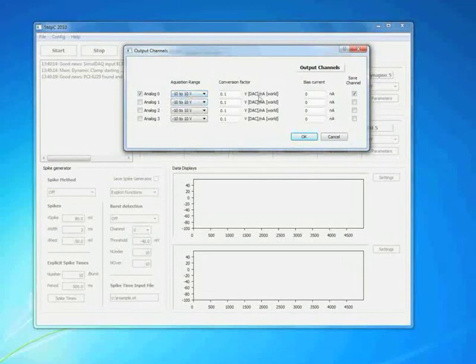And another conversion factor. In this case it is the voltage command at the data acquisition board generates how many nanoamperes that are injected into the cell. This depends on the amplifier that is used. Our amplifier does a 10 nanoamp injection for each volt at its input. So it's 10 nanoamps per volt, or in this writing here it's 0.1 volts per nanoampere.